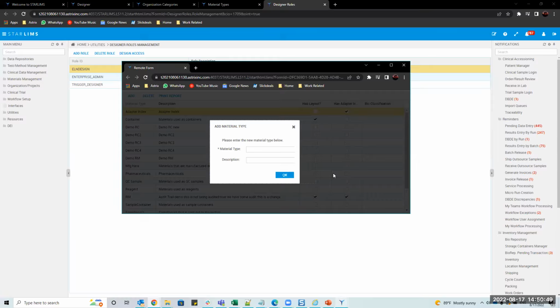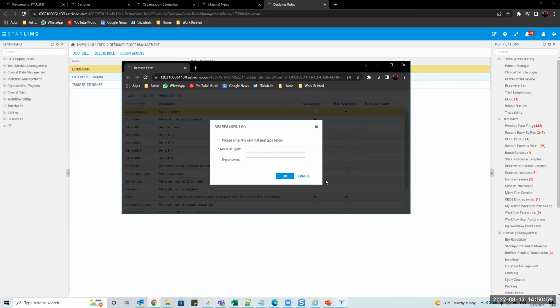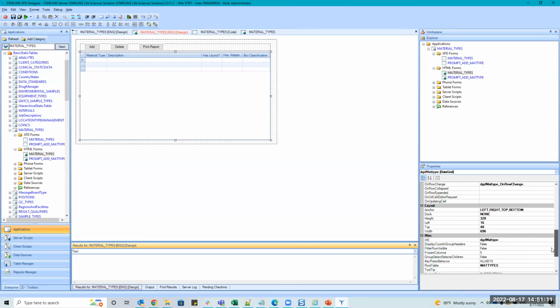You see the cancel just kind of got wiped. Again, you can fix all of that in the form itself. But for this one, it was good enough, I guess, right? So you're not expected to be moving these things around too much. But anyways, that's the type of thing that could happen in the new HTML. So even though it has anchoring set, it's really not recommended.